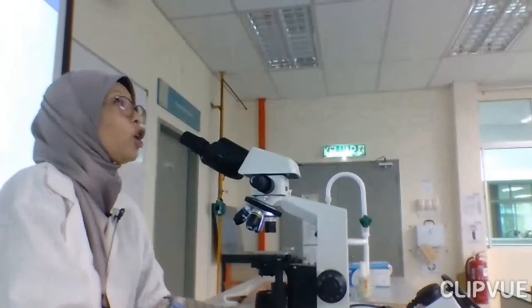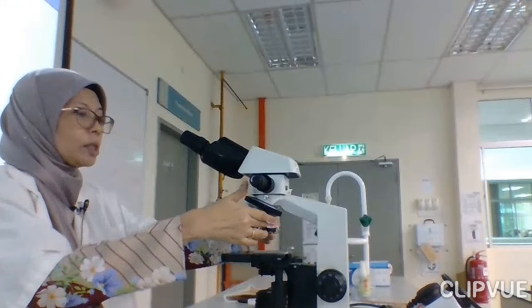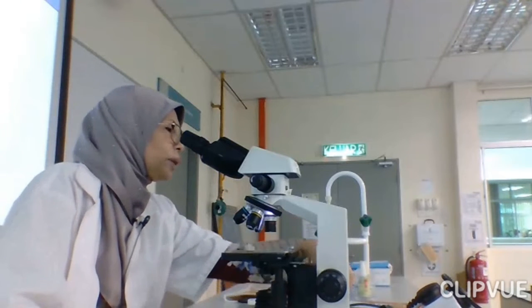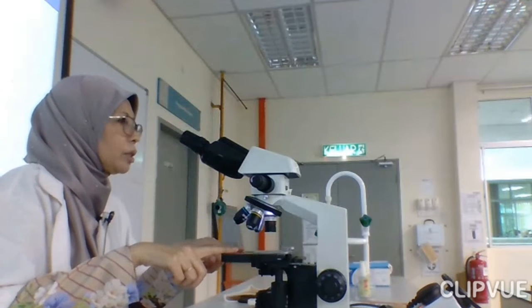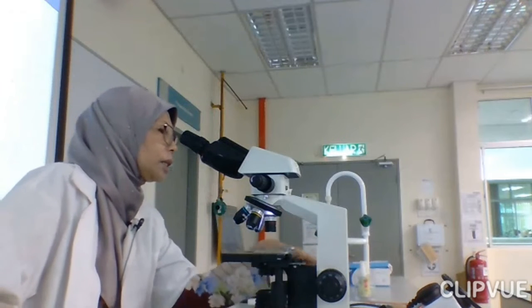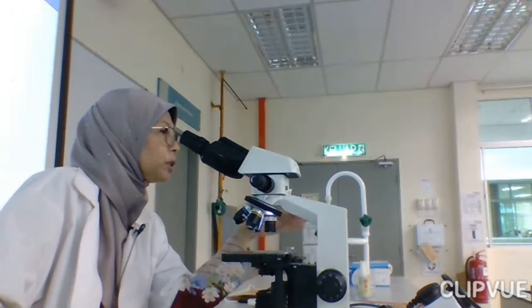We start with the four times objective lens. So four times, above the light source. And before we start, I'm going to make sure that the mechanical stage, this is the mechanical stage, where you put the slides on. So these are the knobs, another important part of the microscope that gets used.